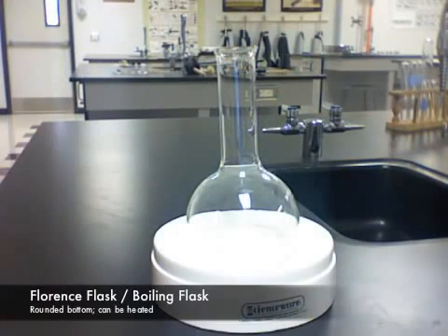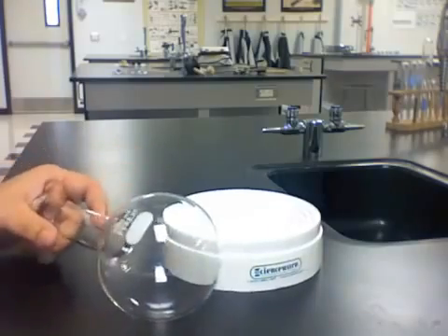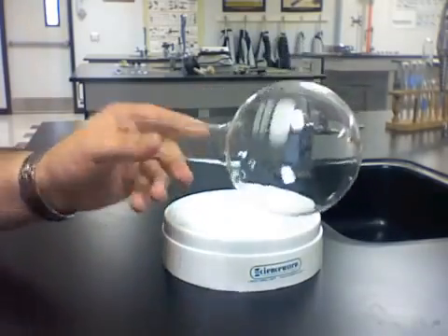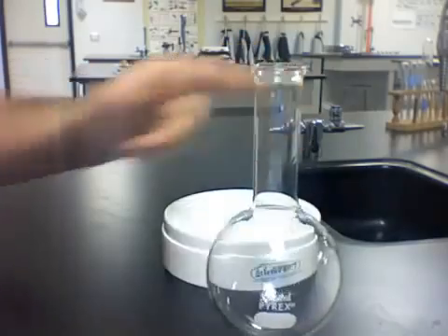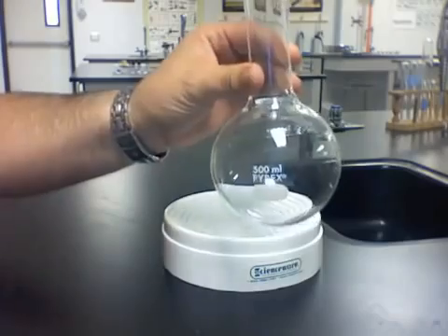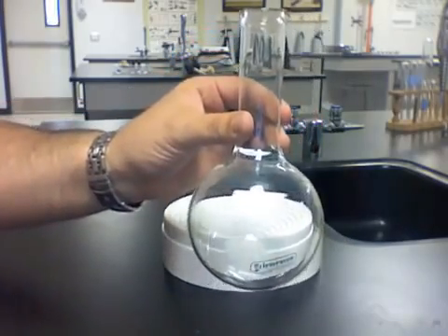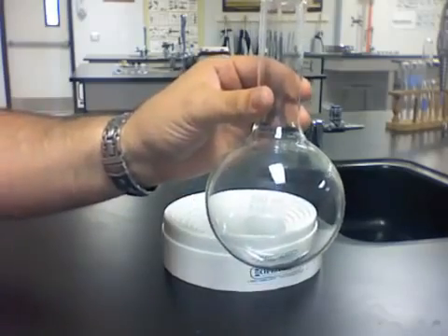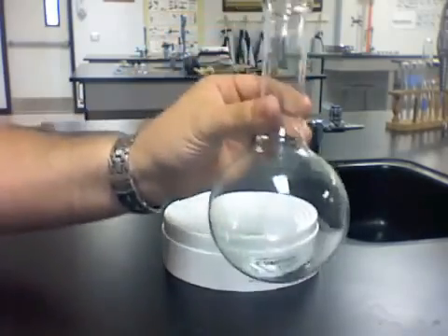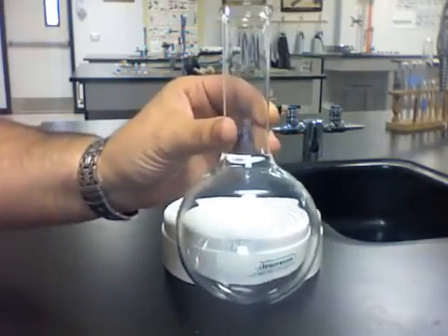This is a Florence flask. It looks like a volumetric flask, but it has one very important difference. This one can't stand up on its own because it has a completely round bottom. Look at that. If I tried to stand it up, no, it wouldn't do it. This is also called a boiling flask. You would have to clamp this into some sort of equipment to hold it upright over a heat source. You can't heat a volumetric flask, but you can heat one of these. So this is a Florence flask, also called a boiling flask.